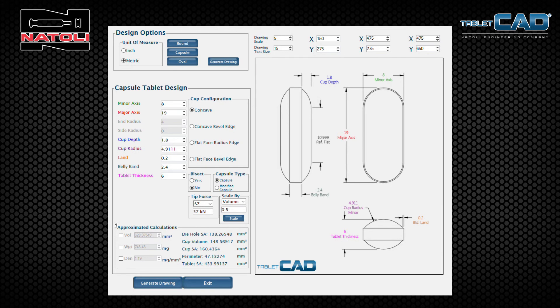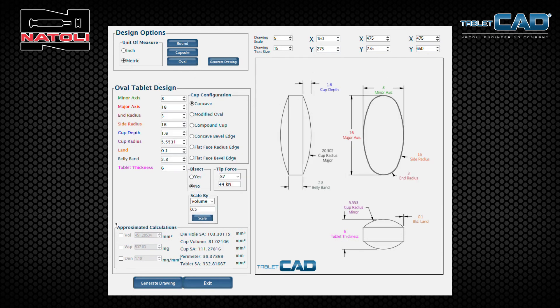The other tablet shape I'd like to show you is the oval shape. It also has a major axis, a minor axis, a cup depth, and a land, but an oval shape will always have an end radius and a side radius — this is how you manipulate the design of your oval.